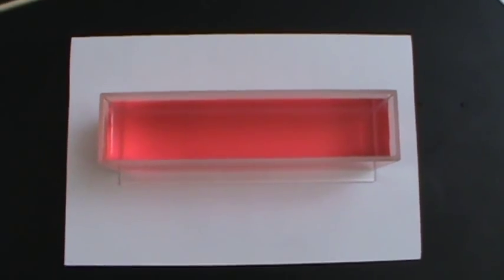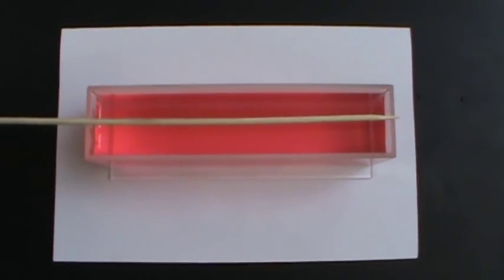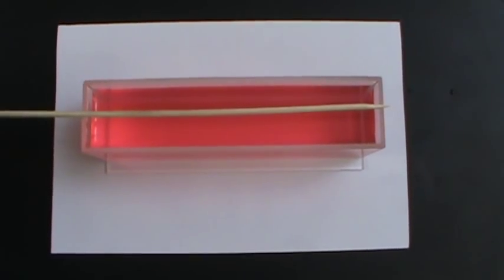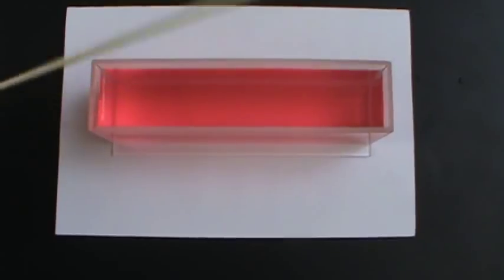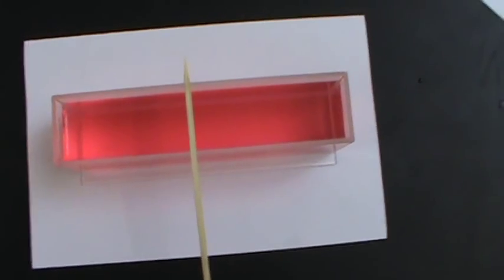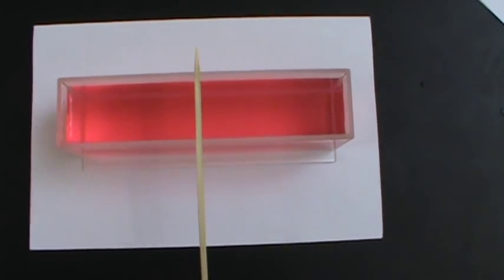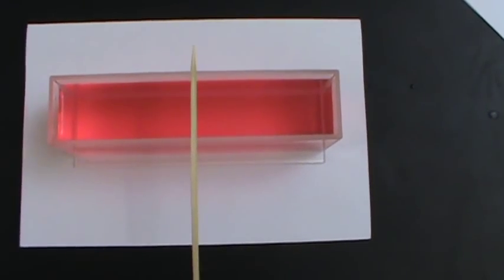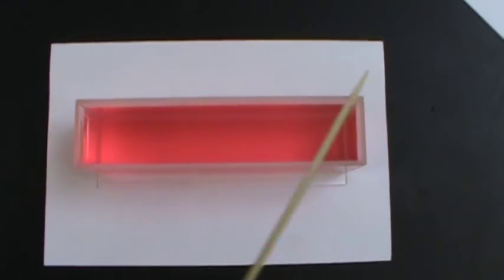So path length, or the amount of substance that light has to travel through, if I'm going through this direction, the light has to travel through a lot more liquid. That means that it's much more likely that that light is going to interact with a particle that's in the solution. If I go through this direction, there's only about 1/5 the amount of liquid. There's only about 1/5 the probability that I'm going to interact with a solute particle, one of the particles that's making this particular solution look red. So this is an important thing to remember when we're looking at path length. And it's really pretty intuitive.